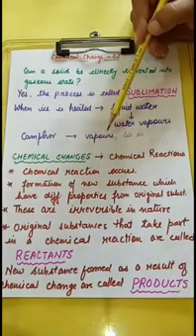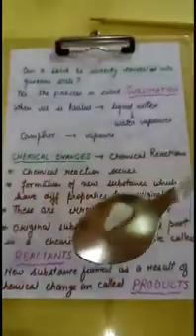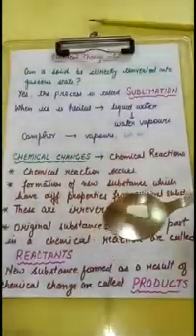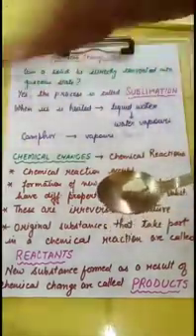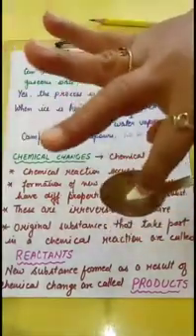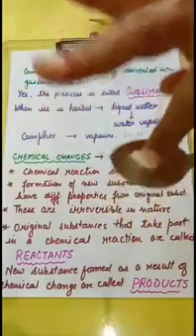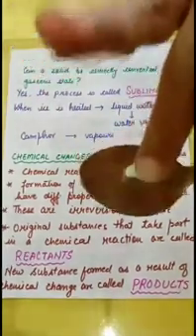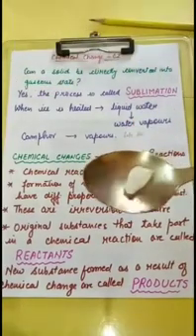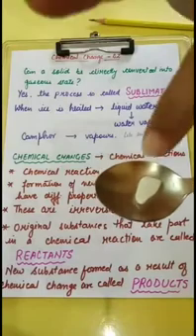Let's see this. Now you see the fumes coming out of it. Now this camphor is changing directly to vapors, not in liquid state. I have heated the spoon prior to keeping this camphor, and this camphor is changing directly into fumes. This is the process of sublimation.